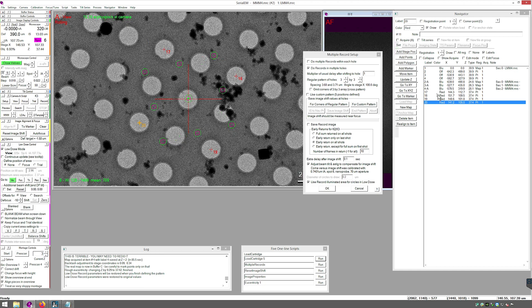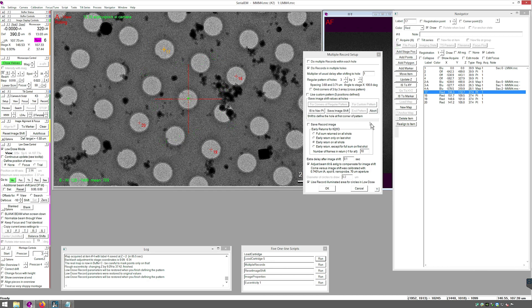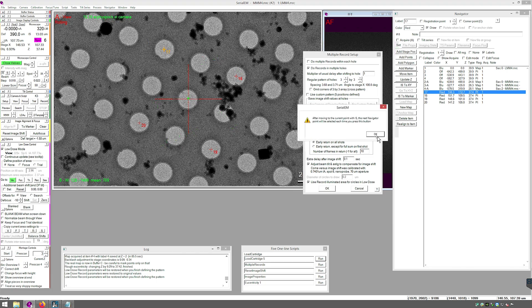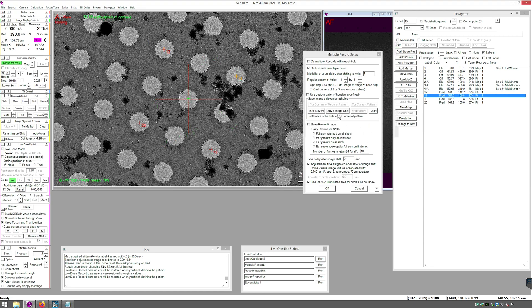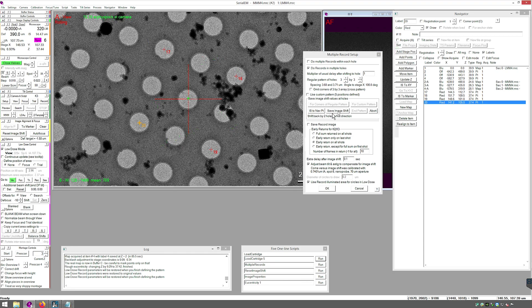Select the top left box point. In the Multiple Record Setup dialog box, press Four Corners of Regular Pattern. With the first point in your group selected, press Image Shift to Nav Point. This tells Serial EM that it will automatically move to the next point as long as they are in the same group. Press OK, then Save Image Shift. Repeat Image Shift to Nav Point and Save Image Shift for the remaining points.